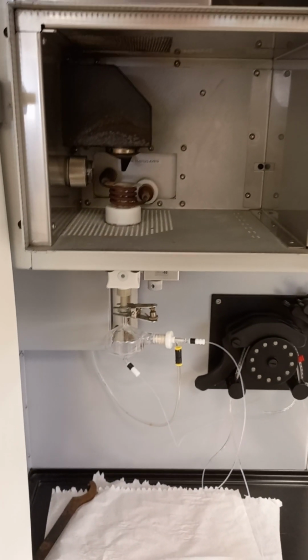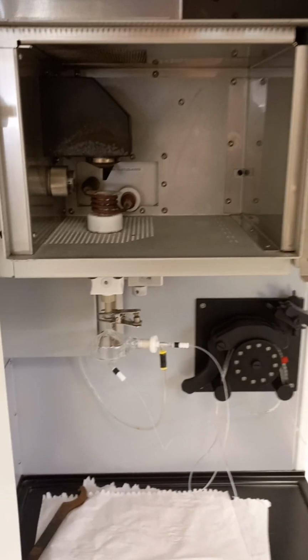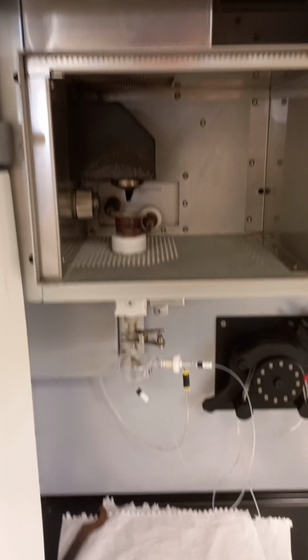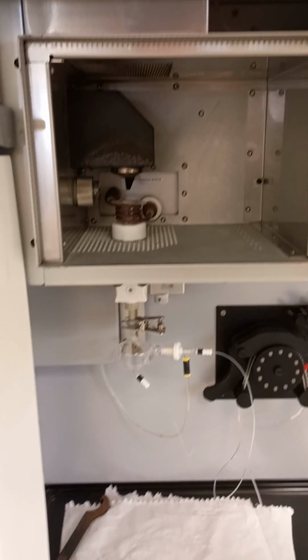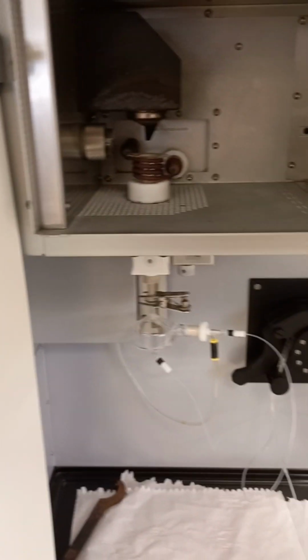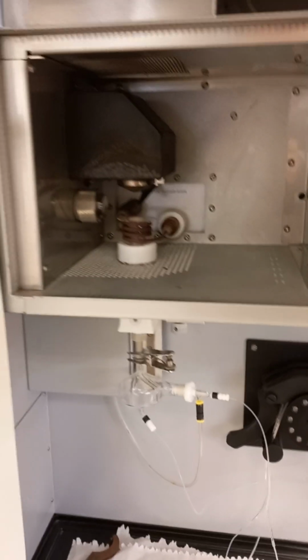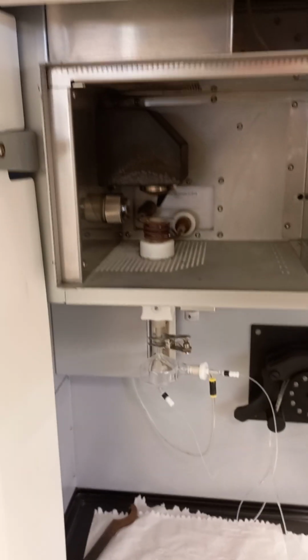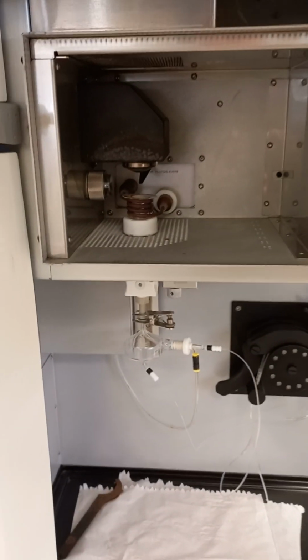I just select an option, which element, which line to be exact, and I may measure the same element by different lines and different views. So I just select the option, which line to measure by axial view and which line to measure by radial view. Of course, it all costs a bit of time, part of a second, but if your set of elements is about 30 or even more, it's seconds and minutes.